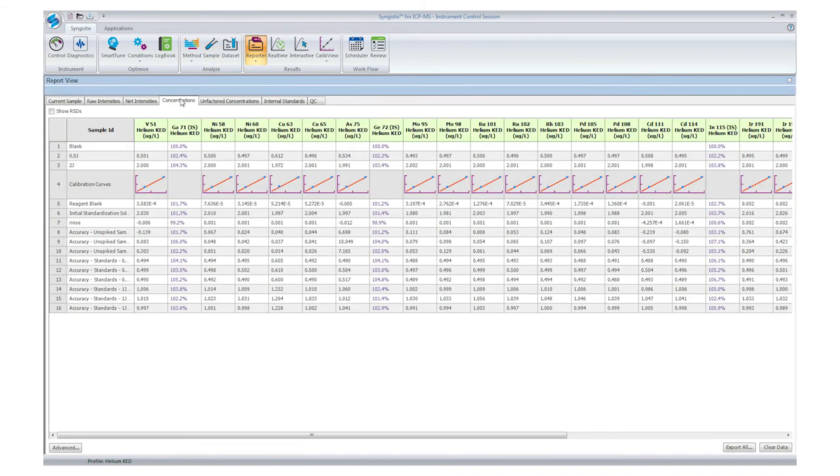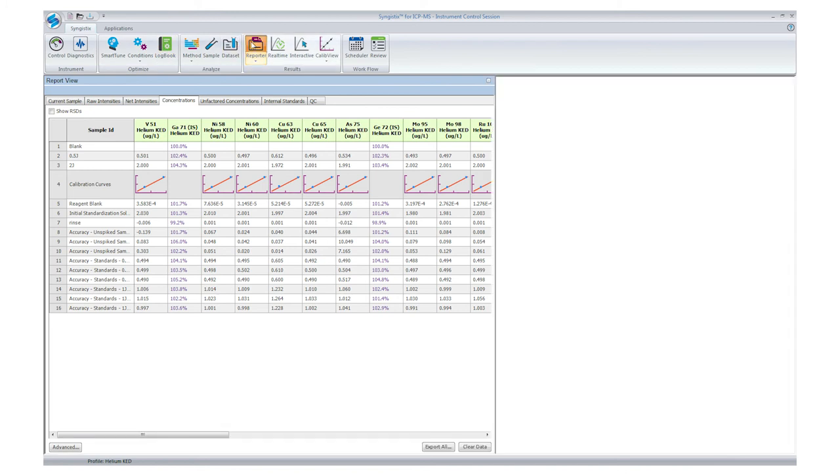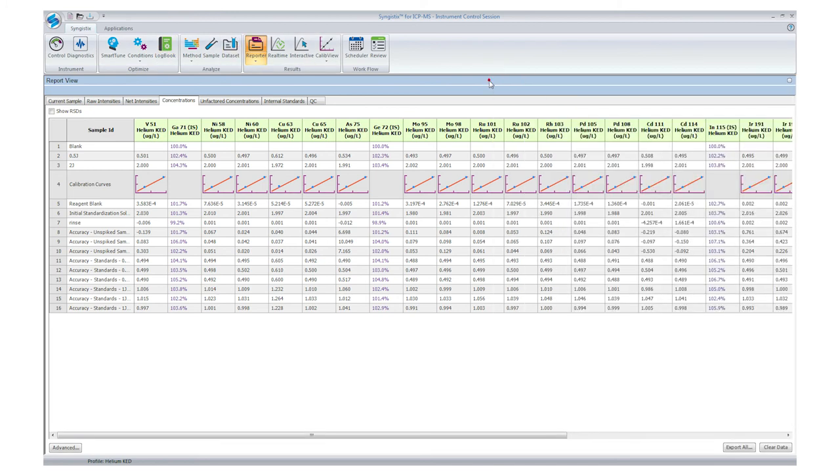Now that our analysis is complete, we can examine the data. This is the reporter screen which summarizes the analytical data. As you can see, there is a snapshot of the calibration. To get more details, you can click on any of the small calibration plots to open the full calibration window.